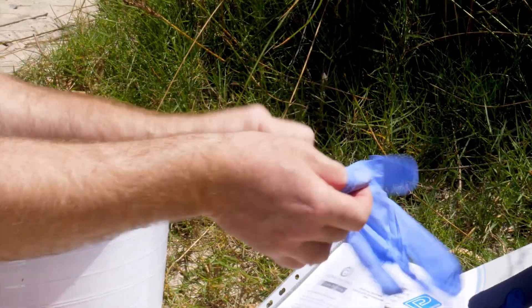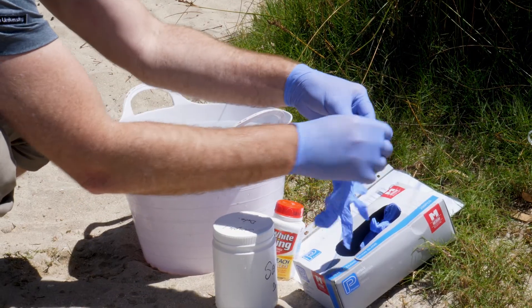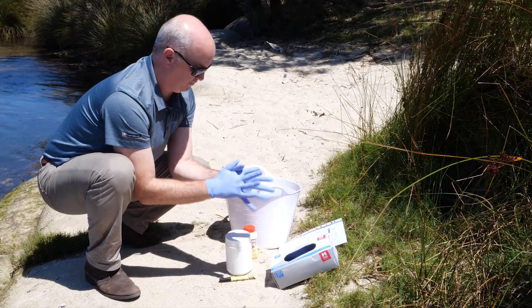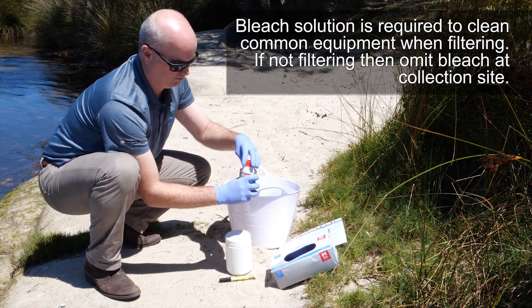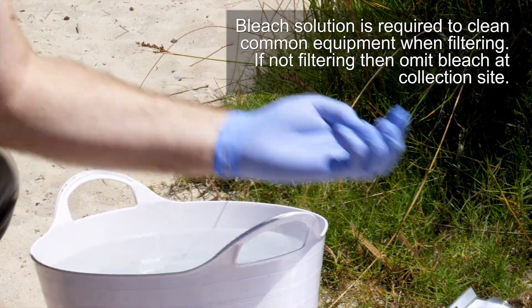To begin, start by putting on a pair of gloves. You'll find it easier to start with two pairs of gloves, as your hands get wet and changing gloves can be difficult — a glove on glove is less adhesive. Open the bleach tablet container and place four or more tablets into a large tub filled with approximately five litres of clean tap water and mix to dissolve the tablets.